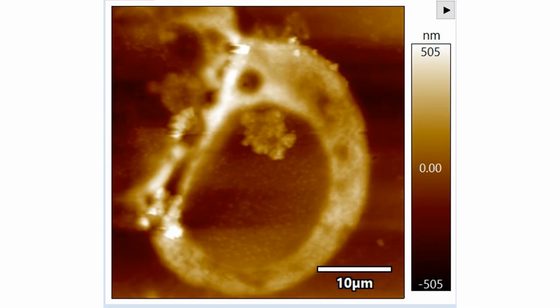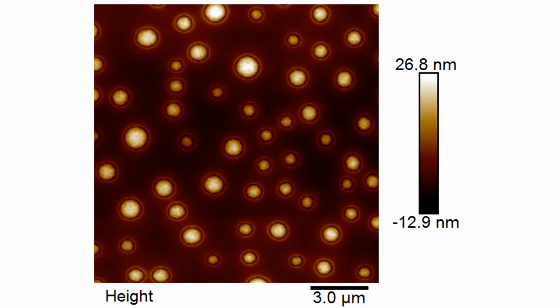This image is a zoomed in image of the previous photo. So now we're looking at about a 40 micron scan of what is a dried out cancer cell. This is a breast cancer cell that we got provided by a group out of Rockville, Maryland, to do some collaboration. Again, some more height data.